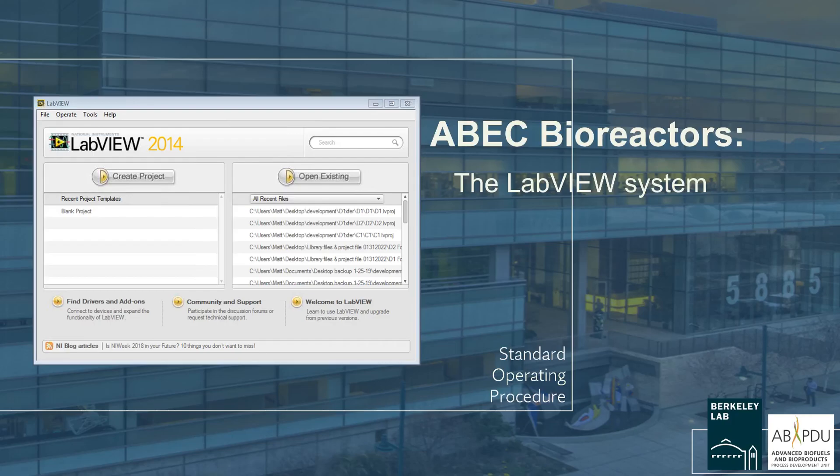This includes plugging in external devices such as pumps and scales via serial cables and launching reactor-specific project files and IP routing table among others. This SOP is designed to walk you through each action item.